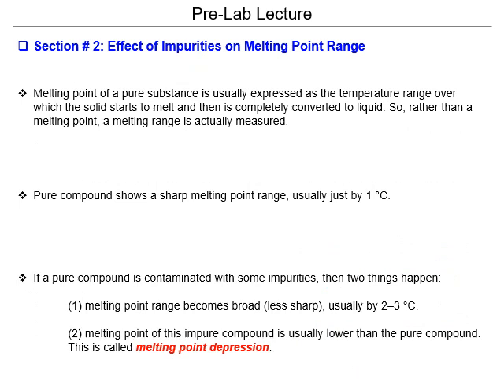Now, when we're talking about melting point ranges, that's generally of a pure solid. What we're going to be discussing in this lab is the melting point of a system where you have multiple solids or impurities in a solid. When you do a melting point for a pure substance, you express it as the temperature range when the solid starts to melt. It's not an exact point, it's a range. When you're taking a measurement, you note when the first little bit of liquid starts to form, and then when the whole thing turns to liquid, that's the end. That range is your melting point range.